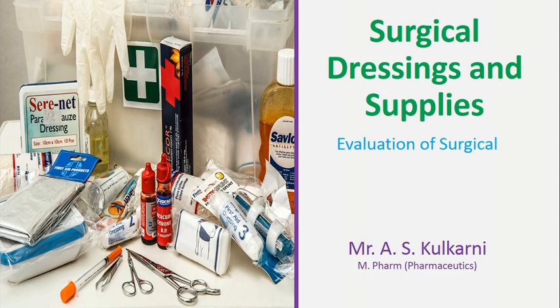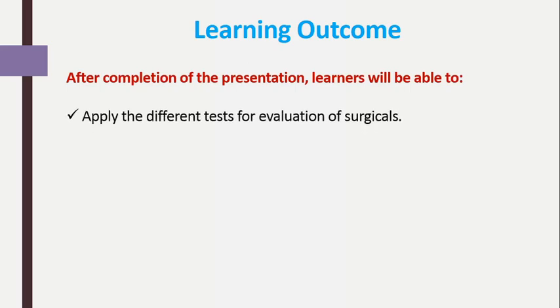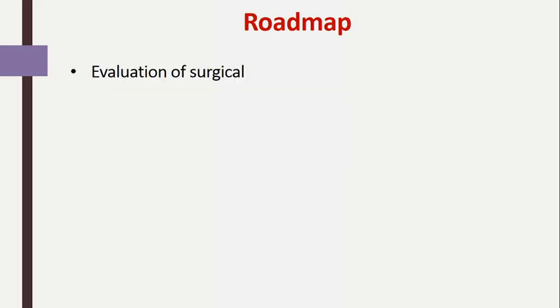In this presentation, we will see evaluation of surgicals. After completion of the presentation, you will be able to apply the different tests for evaluation of surgicals. So this is the learning outcome of today's presentation. Roadmap of this presentation: we will see only one point, that is evaluation of surgicals.